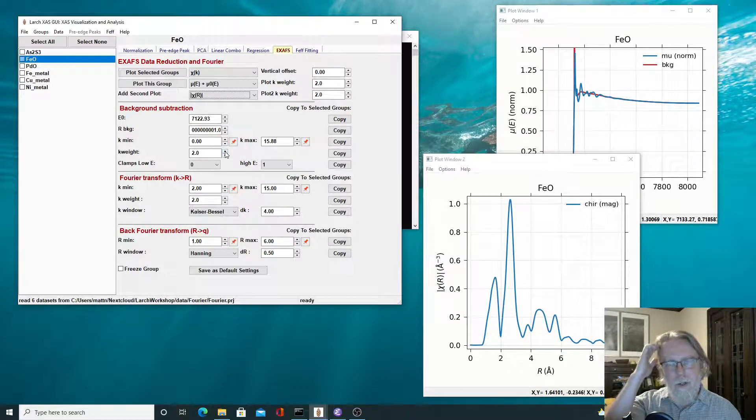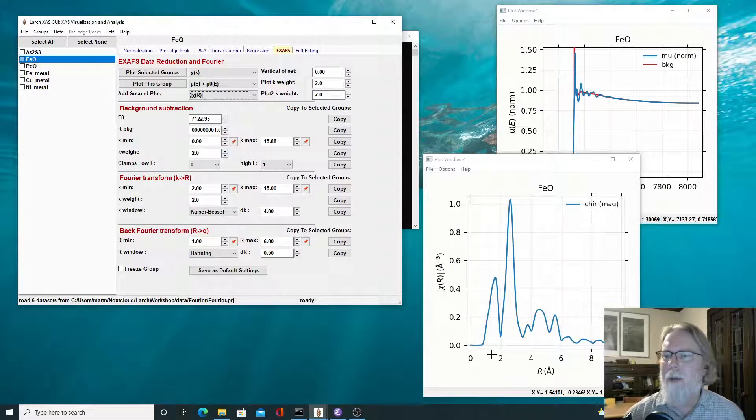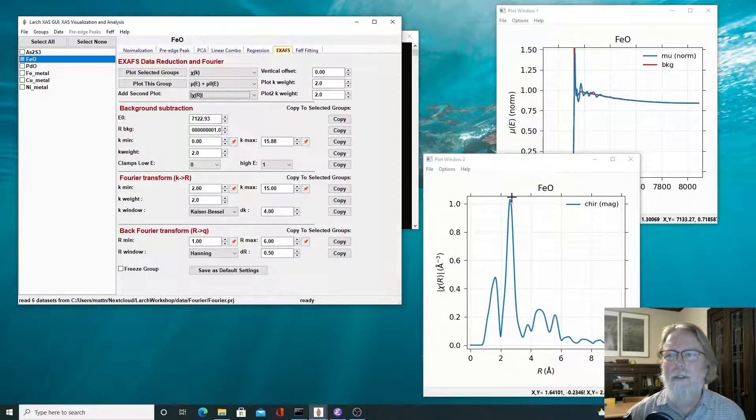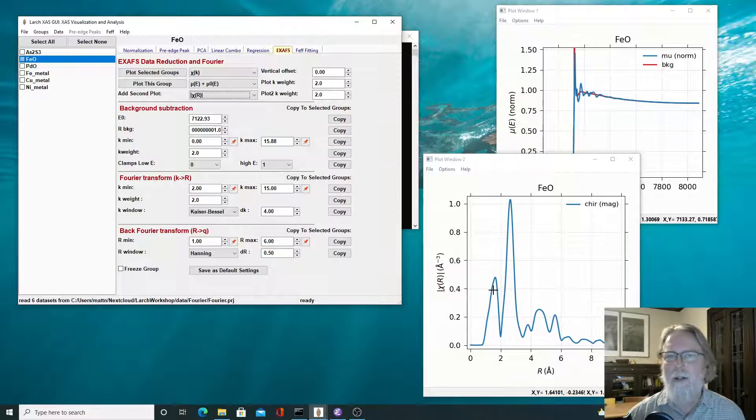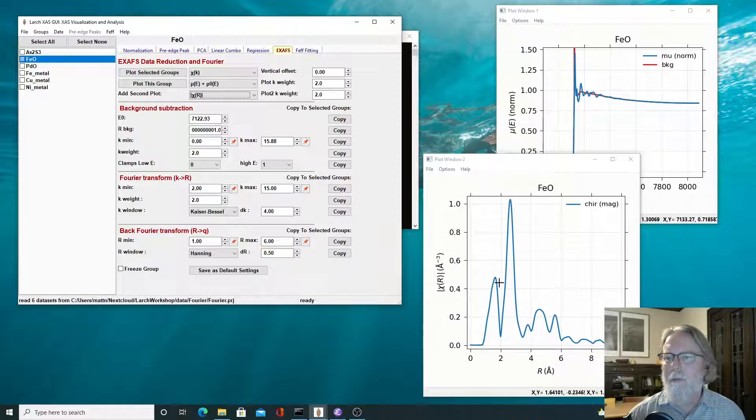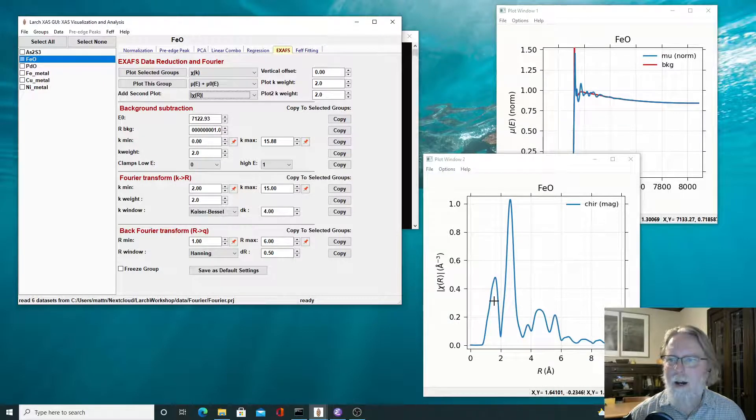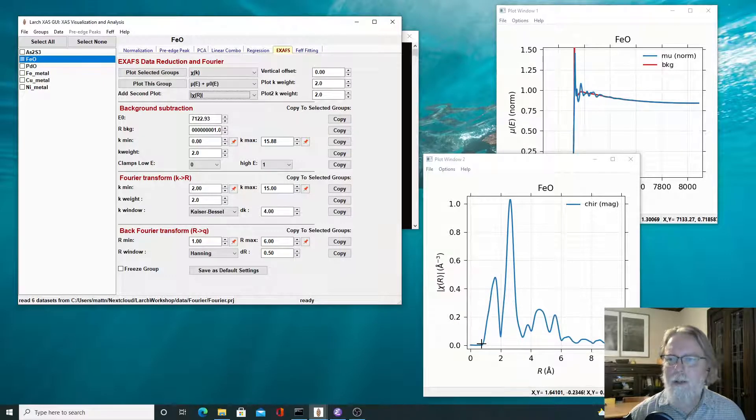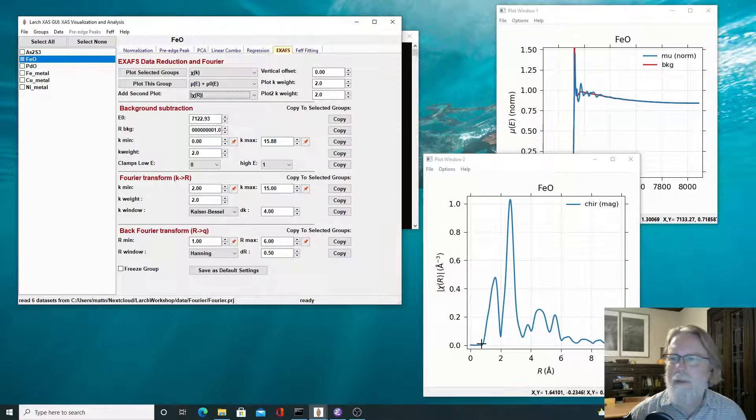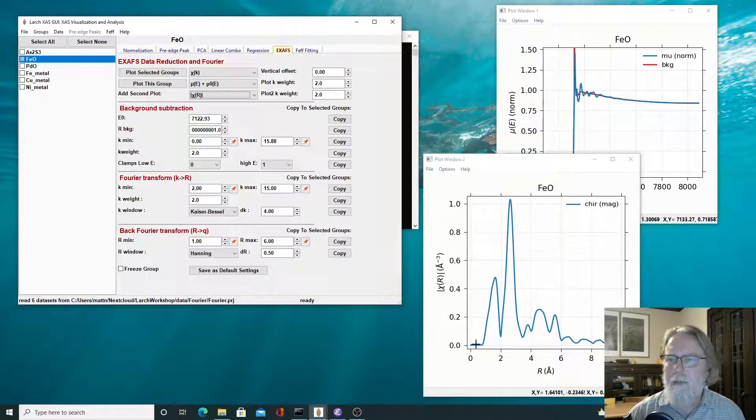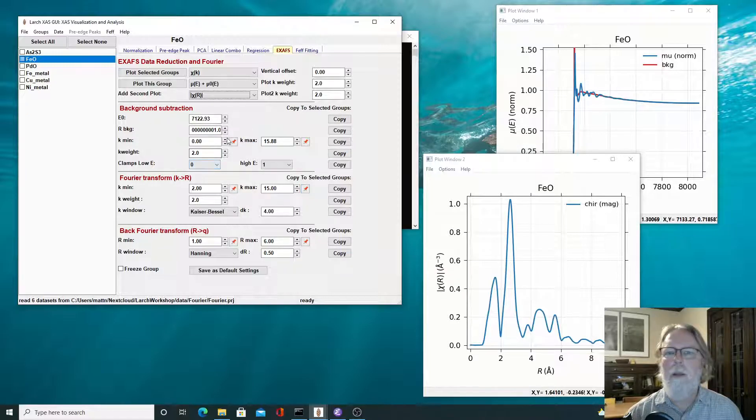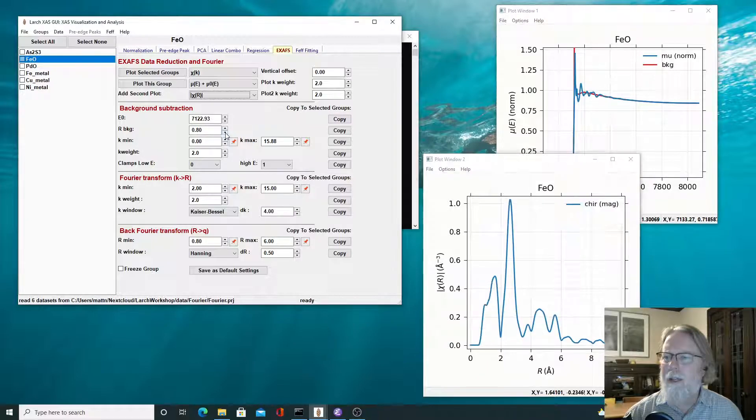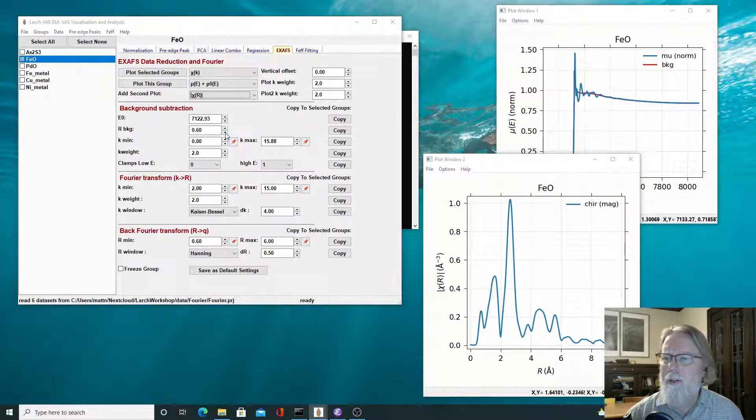And if I go to 1.2, it's still not great. And it looks like it's going way off the rails at the high K end. So I'm just going to change the K weight to 2 and then make that RBKG be 1. And that looks actually pretty decent. If I make that 1 and that RBKG of 1 and a K weight of 2, it looks pretty decent. So the main, the secondary parameter that you'll want to play with is the K weight. You can also, so let me show you this stuff. So this data is iron oxide. So here, this is the iron-iron scattering peak. And this is the iron oxygen peak here.